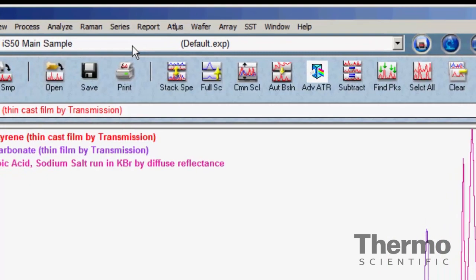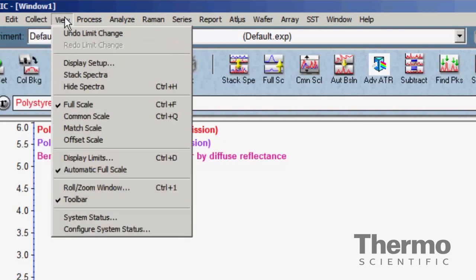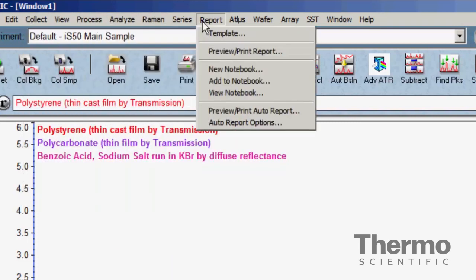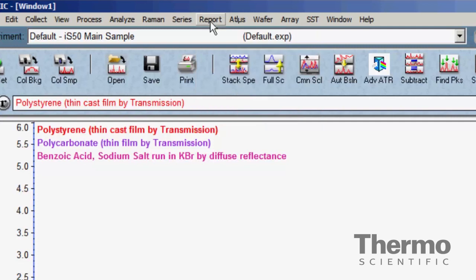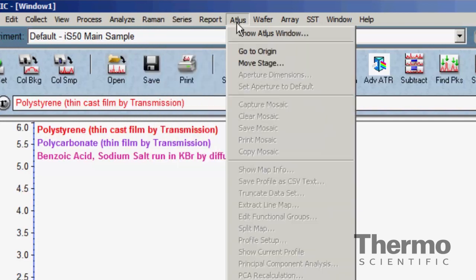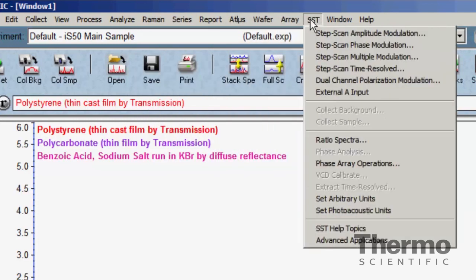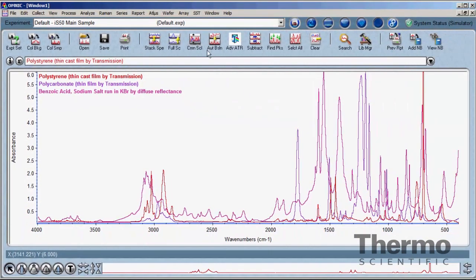All installations of OMNIC software contain a core group of tools that appear on the Collect, View, Process, Analyze, and Report menus. Additional menus become available with additional hardware configured to the spectrometer. The Raman, Series, Atlas, Wafer, Array, and SST menus work with specific additions that address unique analysis approaches.